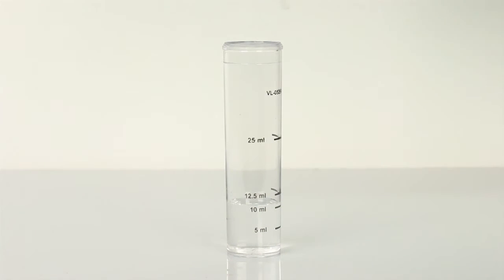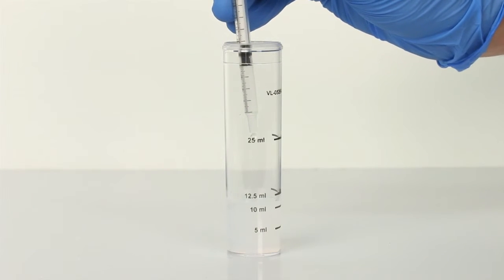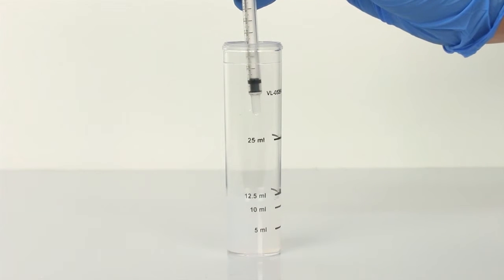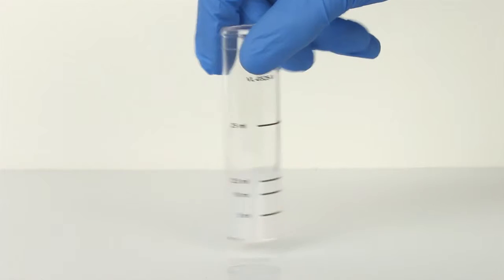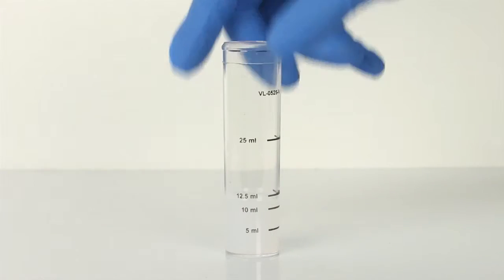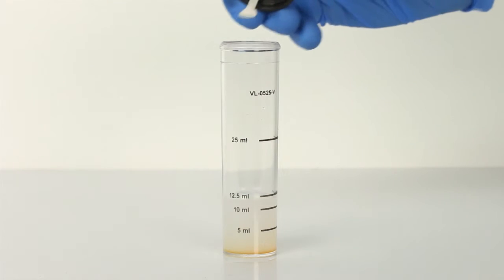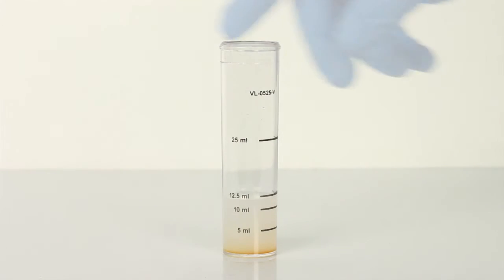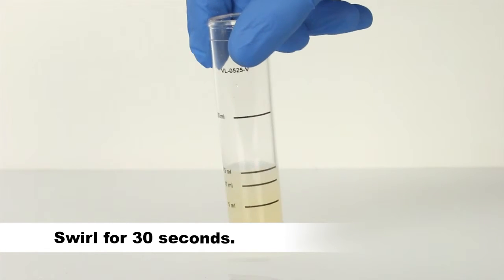Add the 1 ml of reagent and swirl to mix. The sample will become cloudy if chloride is present. The next step is to add 3 scoops of titration indicator powder. Swirl to mix for about 30 seconds. The sample will turn slightly yellow.